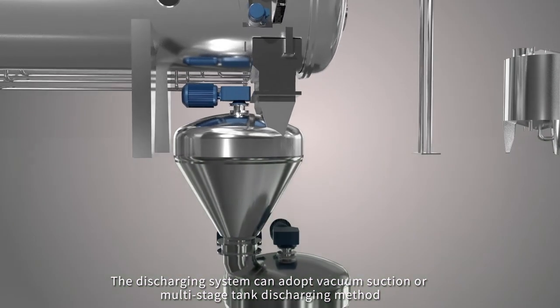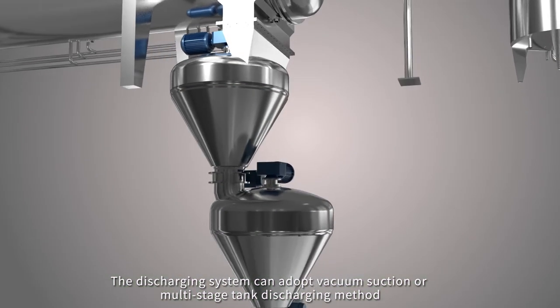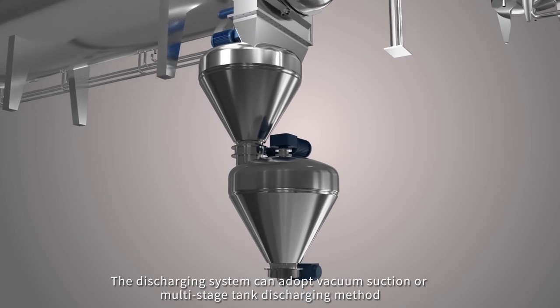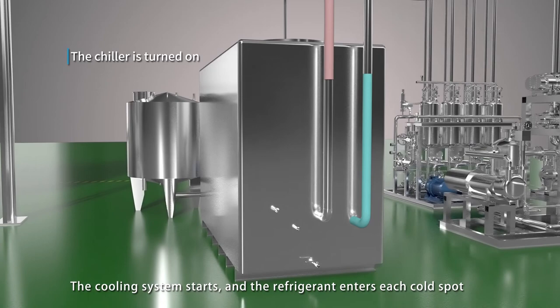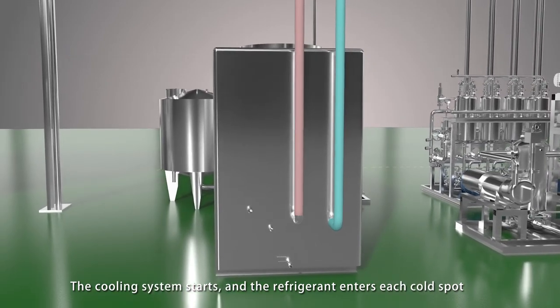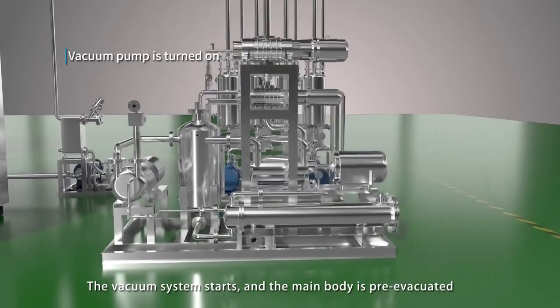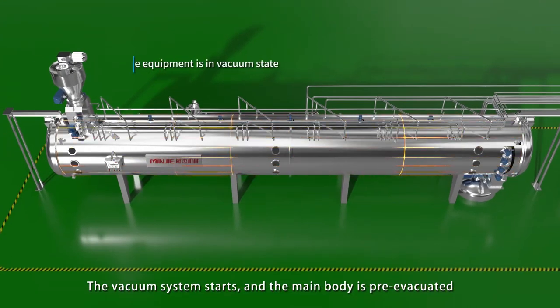The discharging system can adopt vacuum suction or multi-stage tank discharging method. The cooling system starts and the refrigerant enters each cold spot. The vacuum system starts and the main body is pre-evacuated.